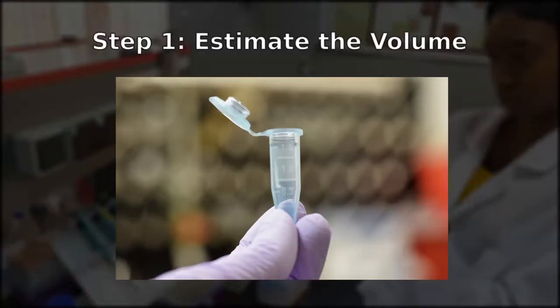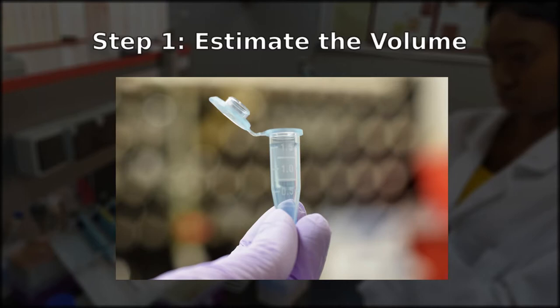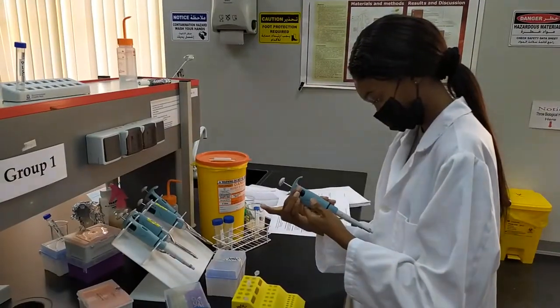All you need is a micropipetter and about a minute of your time. As you can see, epitubes tend to have markings for volumes on their sides. While these will not give you a super accurate reading, they will give you a rough idea of how much liquid might actually be inside.